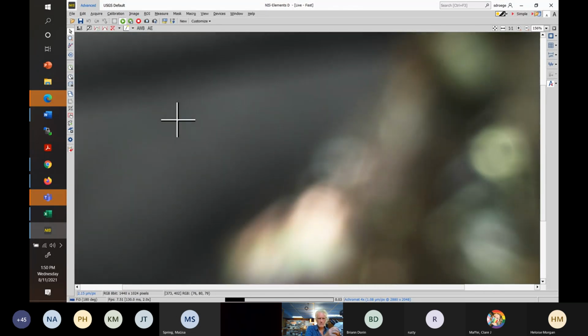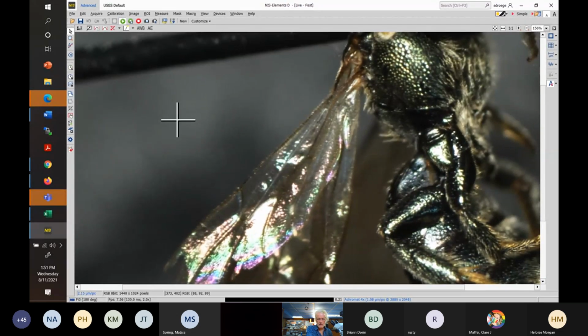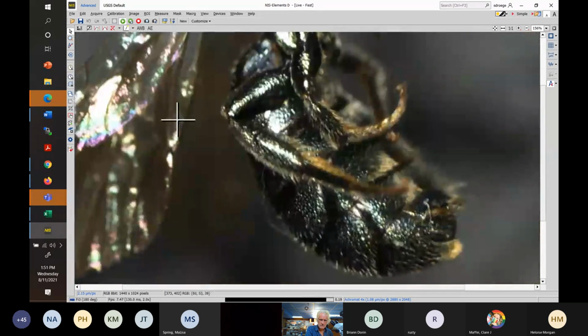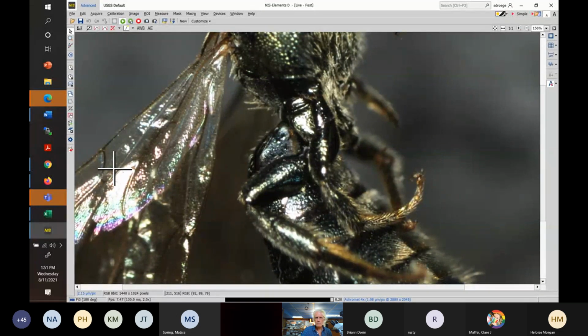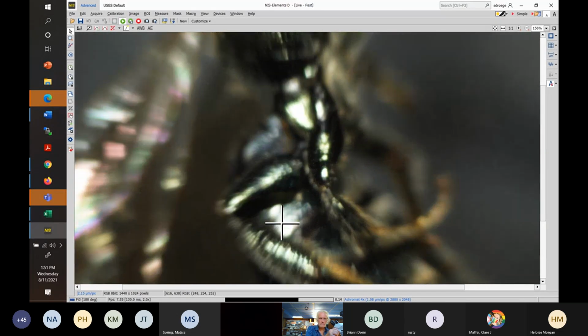Okay, so under the abdomen, there's the sternites. Flange is visible at the bottom. Going to zoom. Just to orient you, there's the coxa. This is the hind leg. I'm going to get a better picture of this, but this is the flange area. You can already see the white tuft of hairs, and that's our marker for dupla.